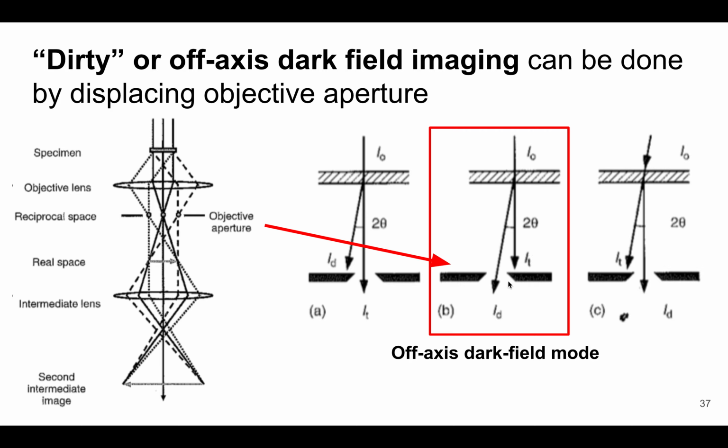So the transmitted beam is, again, the bright part. It's a majority, and this is the light part. So we'd expect this image to be predominantly dark, with the areas that were diffracted being light, because that's what's going through. So it's going to start out dark, and then the contrast off of that is going to be lighter, and that is the diffracted events. Again, this isn't a common way of doing it, but it is one way in which we can get a dark field image.